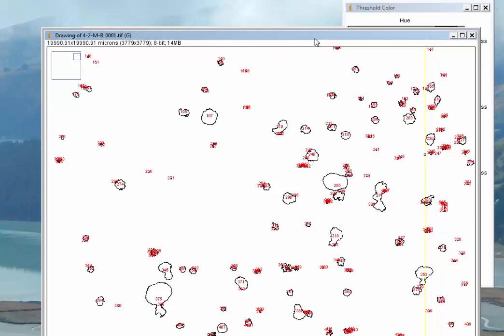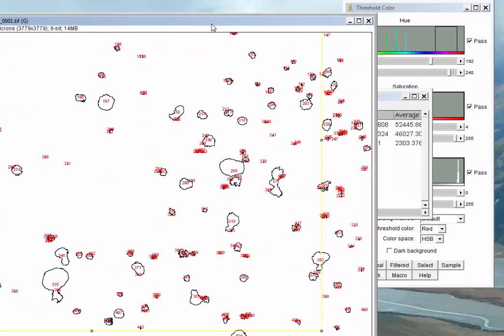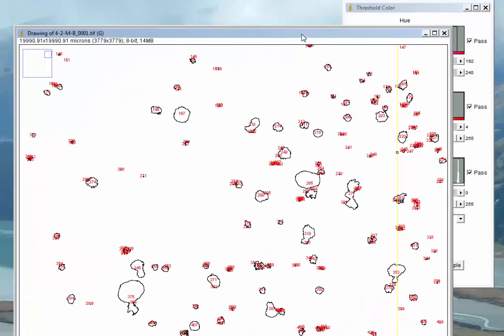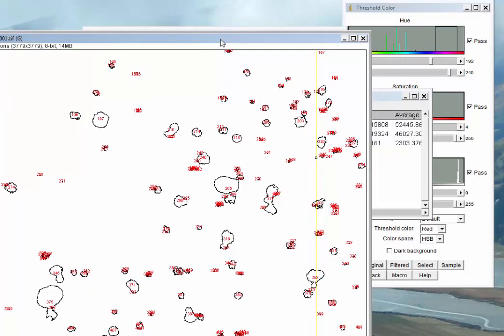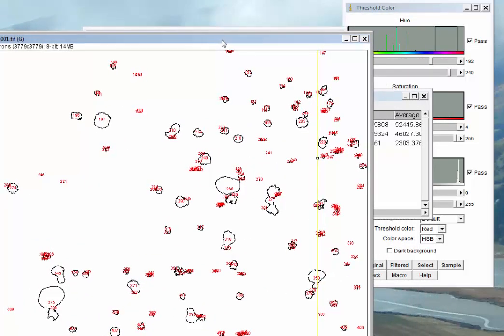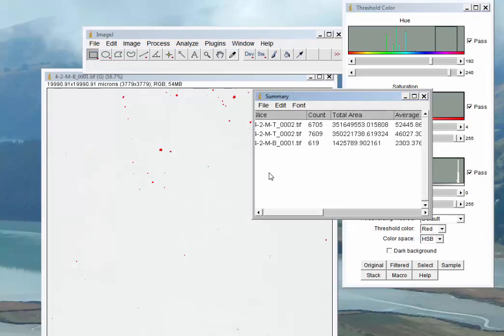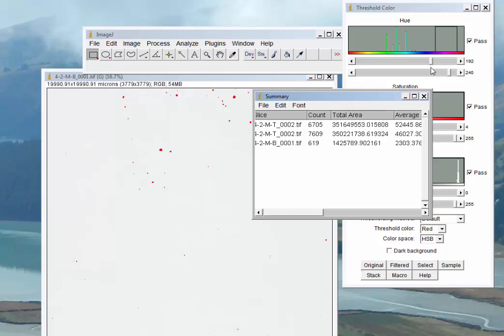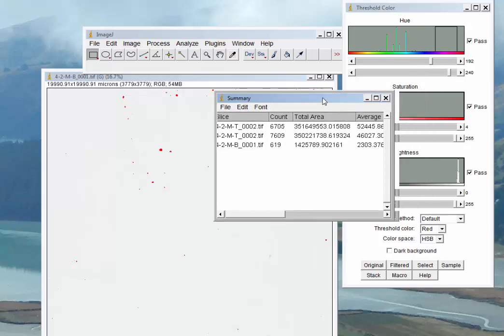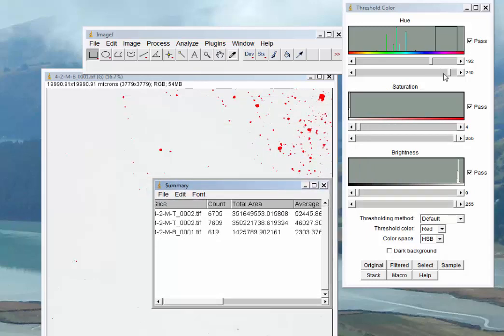While you're staring at all this overwhelmed because it's new, these are some interesting tools that can help you get a contextual feeling of how ImageJ is processing these different types of images. You could and probably should repeat this process with three or four more videos. Once you've done a half dozen of them or so in a row, you'll start to get an idea whether or not the ranges you're working with are the correct ranges.